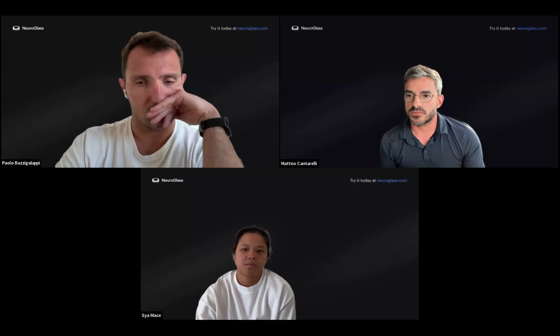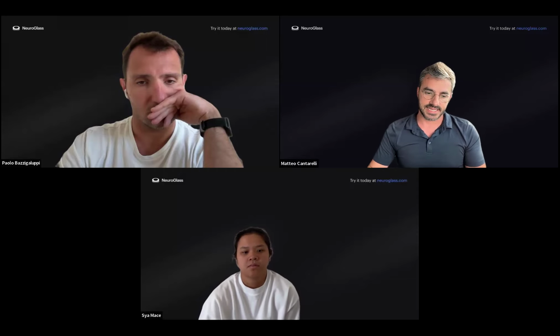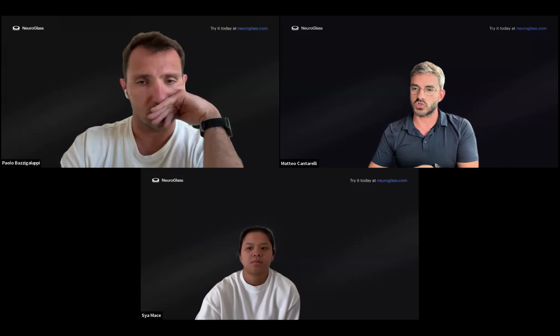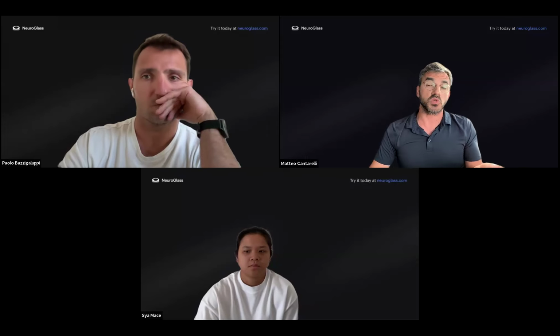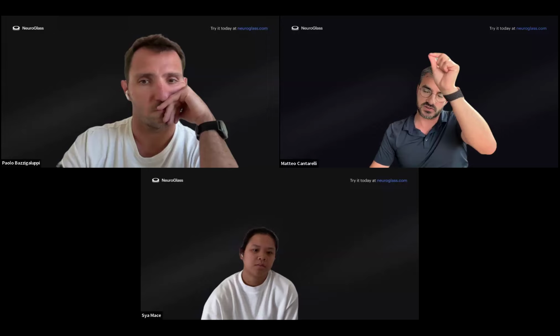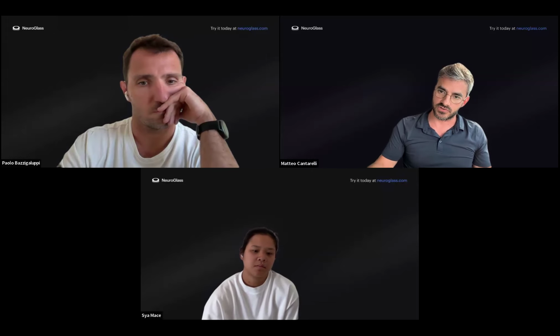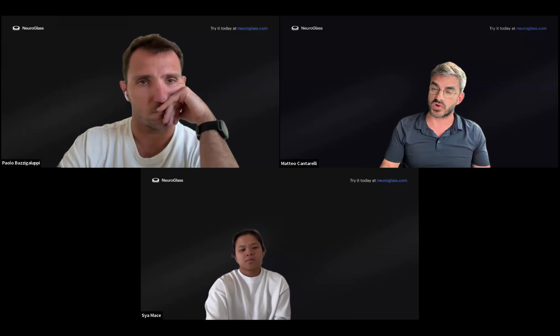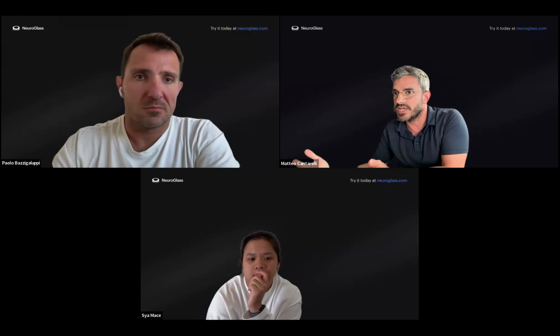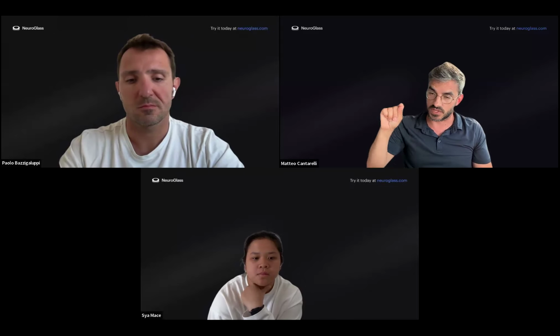Another question: is it automated skeletonization or semi-automated? Right now, with skeleton tracing, you would be able to do two things. One, let's say you want to build ground truth. There is a zero skeleton that exists, and you can just go there, drop your nodes, and create your skeleton. Or you already have an inference that you've been running that gives you some good skeletons, but those need to be proofread. Then we would be loading those on CATMAID and connecting Neuroglancer to it.